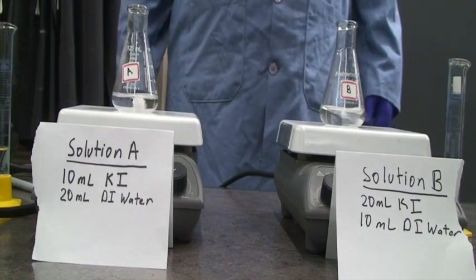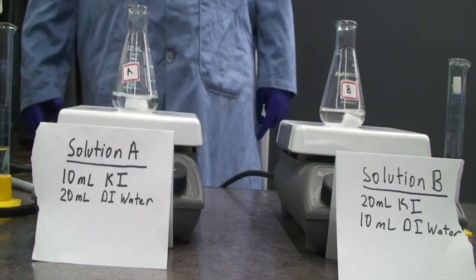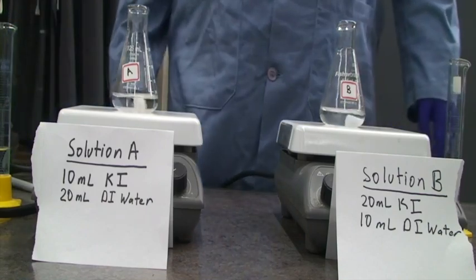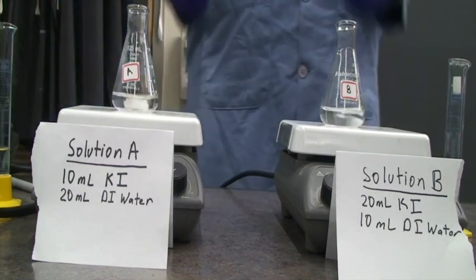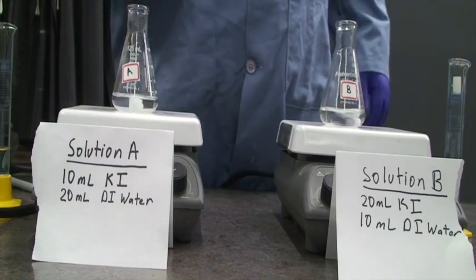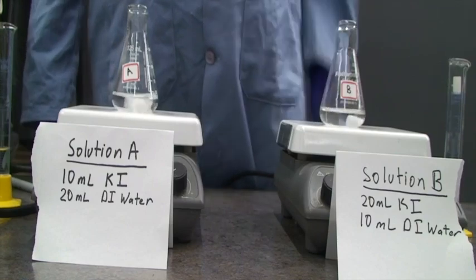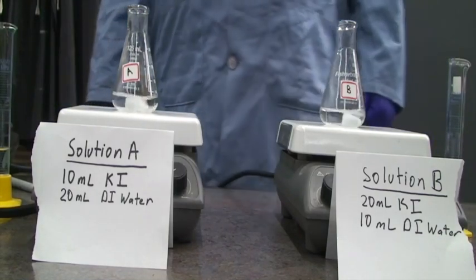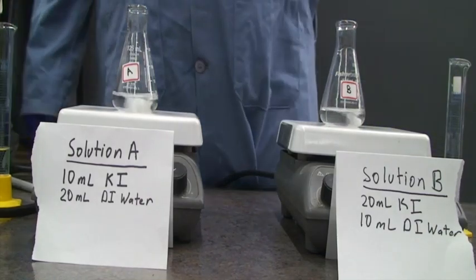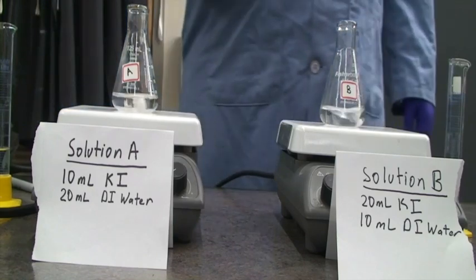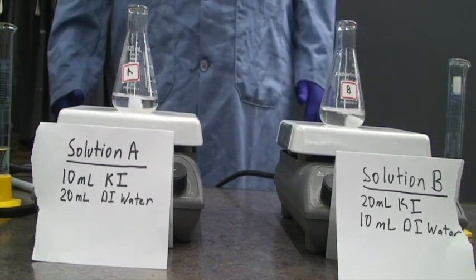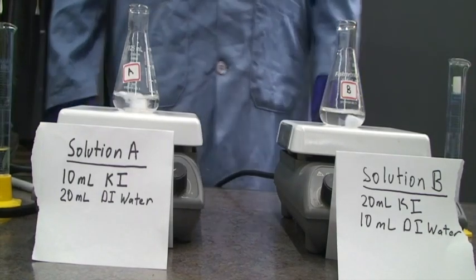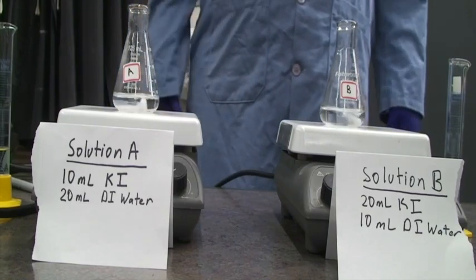We're going to look at part one of the procedure. I've set up two Erlenmeyer flasks: solution A on my right contains 10 mL of KI and 20 mL of deionized water, and solution B contains 20 mL of KI and 10 mL of deionized water. Both solutions are the same volume, but solution A contains less KI than solution B, so we can see how the concentration of KI affects the rate of this reaction.